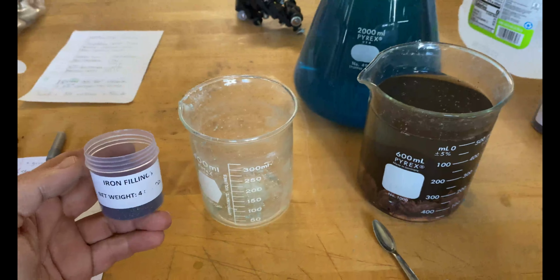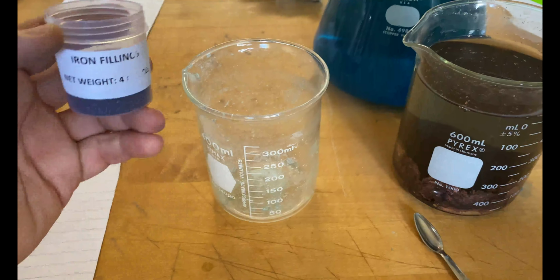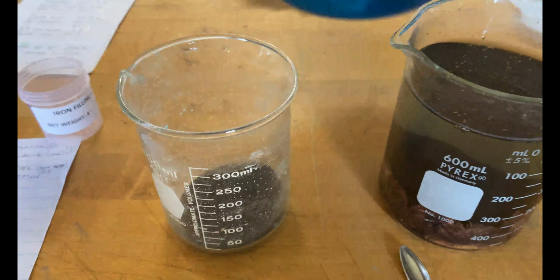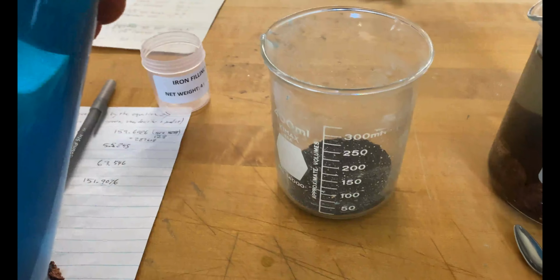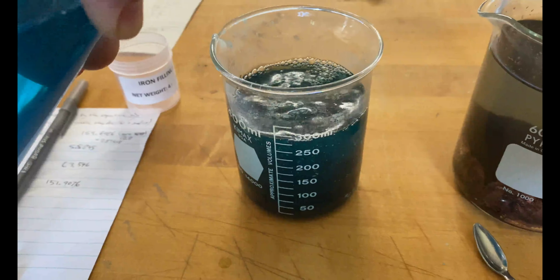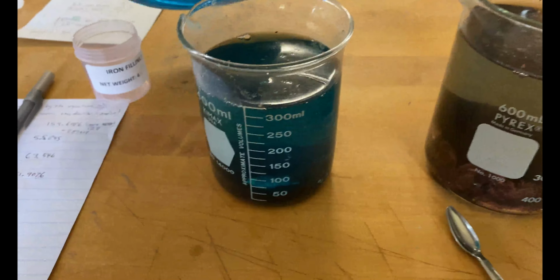Here's a comparison sample. We're just gonna do an excess of iron filings and a diluted solution of the blue vitriol so that we can get green vitriol. We'll just let that sit without magnets and see what kind of a reaction we get.